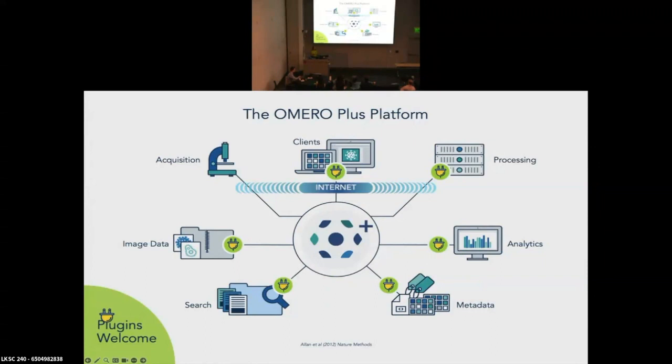We saw some great examples from people like Niels this morning on interacting with data in the browser. Data that's under management in OMERO is very purposefully open to you. So there are APIs that you can use to access your image data, or even ask, where's the file, so that I can go interact with the file directly. We enable that because fundamentally managing your data should not happen in a closed system, because then you're not really solving the problem of easy data access that you want in a data management platform.